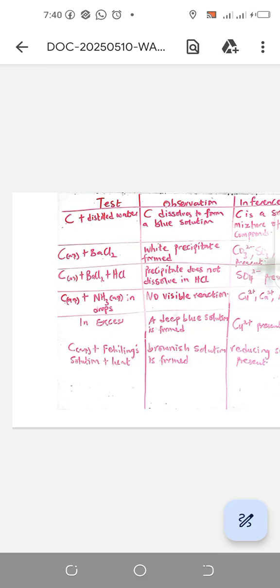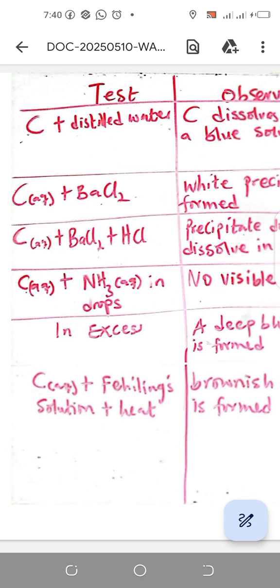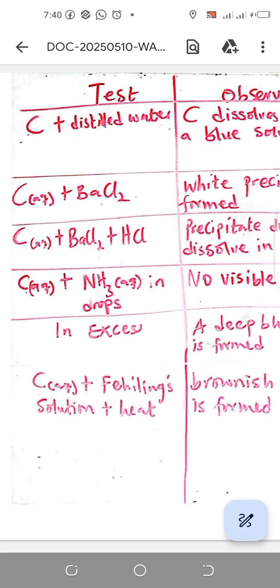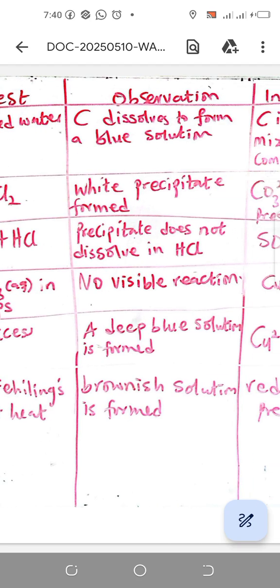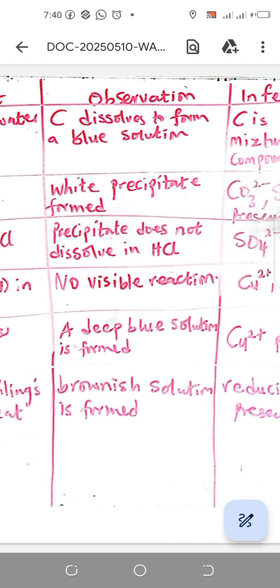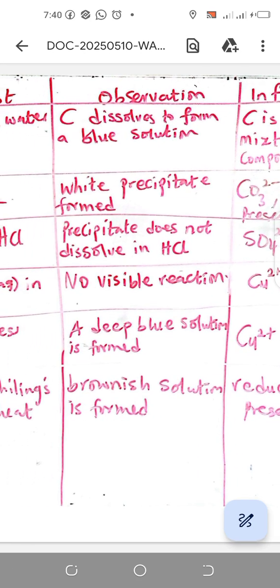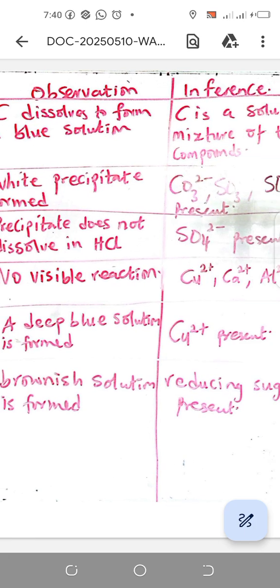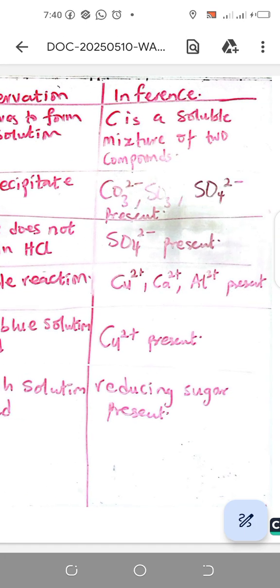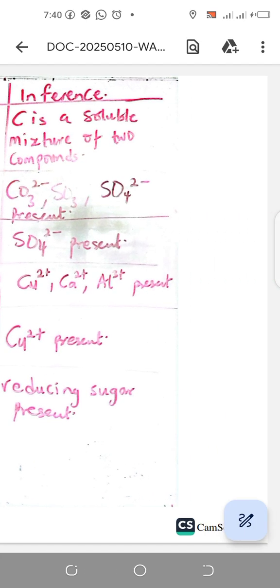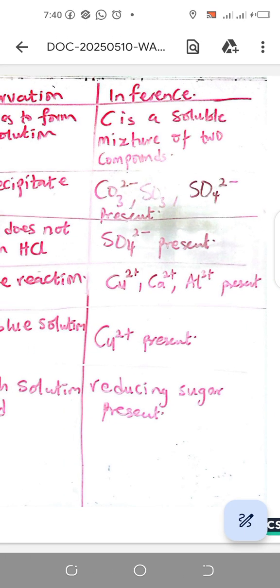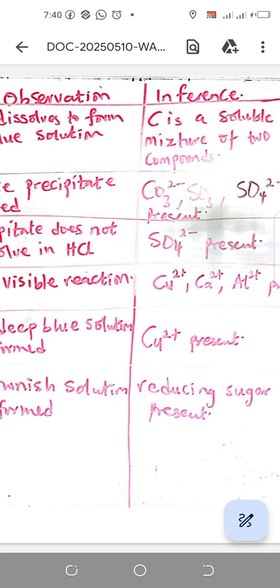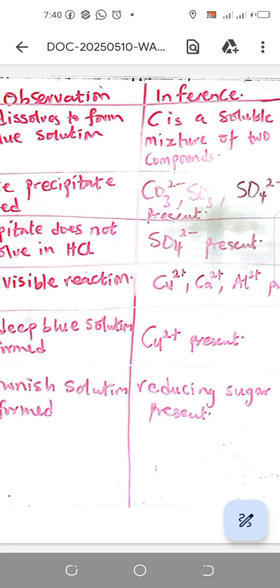To confirm which of these ions it would be, we have to add HCl. That is why you are seeing the test C aqueous plus BaCl2 plus HCl. You discover that the precipitate does not dissolve in HCl, so that makes sulfate ion SO4^2- confirmed.